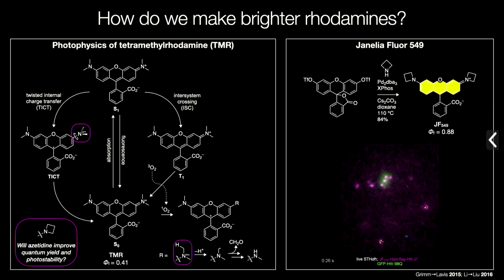And this has enabled some really beautiful microscopy. This is one of my favorite examples from my colleague James Liu. So the magenta little fireflies whizzing around are more or less wild type Huntingtin protein with the normal number of glutamine repeats labeled with JF549 using the HaloTag system. And you can see how they interact with now mutant Huntingtin protein that has expanded glutamine repeats and is labeled with GFP. We actually started a company using this type of imaging as a primary screen for drug discovery.